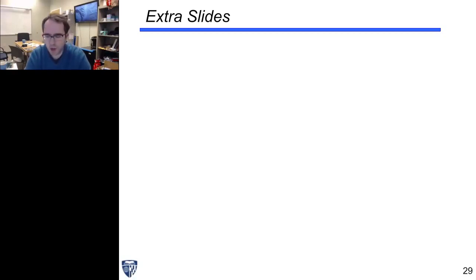I expect that we will be able to find that, and in fact, in the paper that was published at the same time as ours, the back-to-back paper from UCSC, they showed that you can detect hydroxymethylcytosine with Oxford Nanopore data. So the answer is yes. Our classifier doesn't yet do it. We're working on getting a nice training methodology to do that.